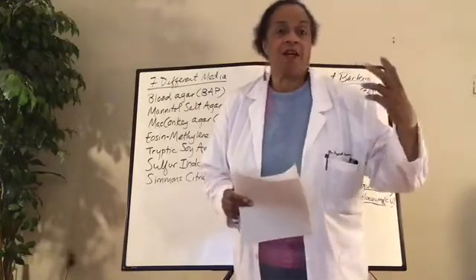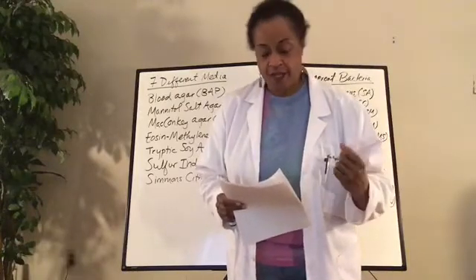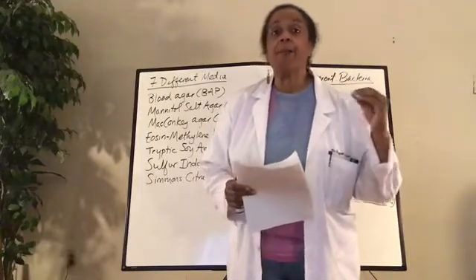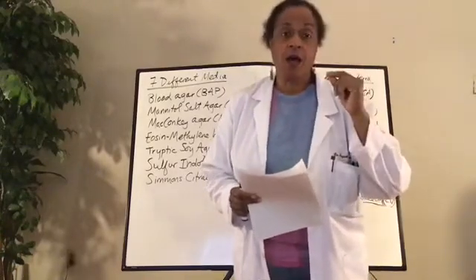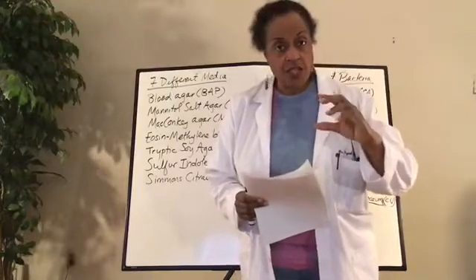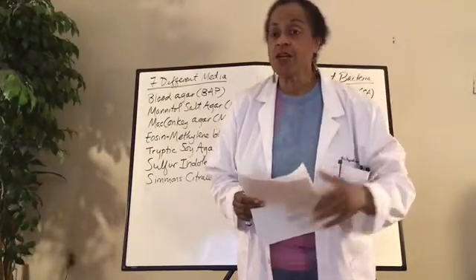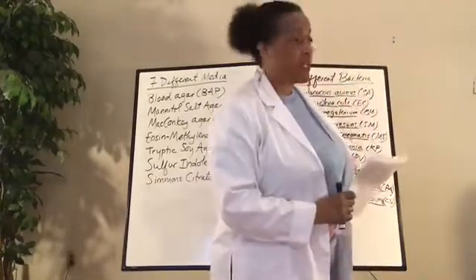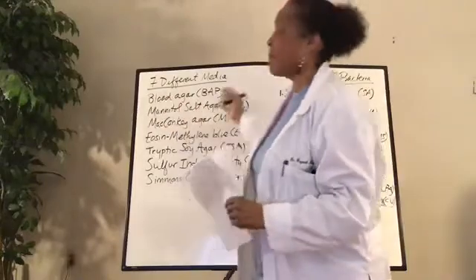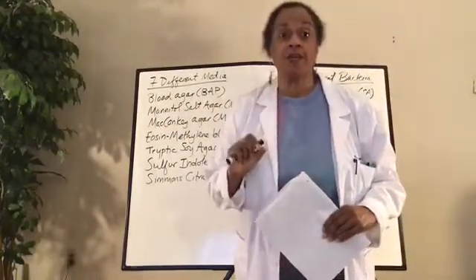Variations, you'll have colony size, the color of the bacteria, and sometimes even the media changes colors. And these are things that you're going to have to check. Did the bacteria change color? Did the media change color? Did they both change color? Sometimes this media could change colors. Sometimes this bacteria could change colors. Sometimes they both can change colors. That's the kind of detail I want to see written up in this paper.